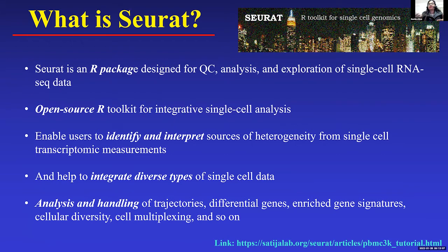As I said, it's growing exponentially, and every now and then a different version comes up. But with Seurat, it will be very easy and handy to integrate such diverse types of data as well. In the webinar, I will also show you how to get hands-on with some free data that are already available. You can get started with them if you want to try the pipeline and get familiar with the single cell analysis pipeline if you don't have your own library of data.